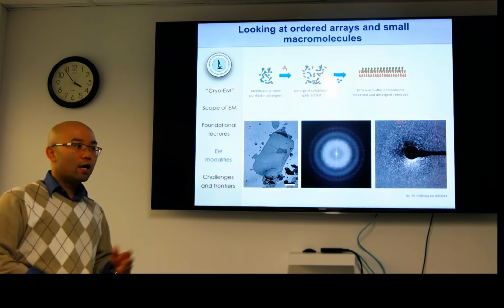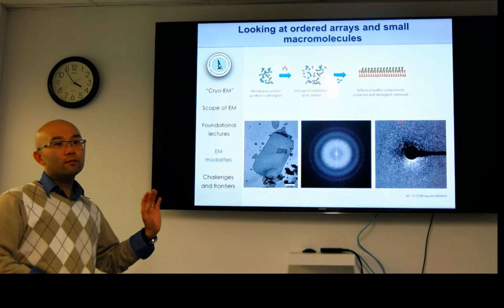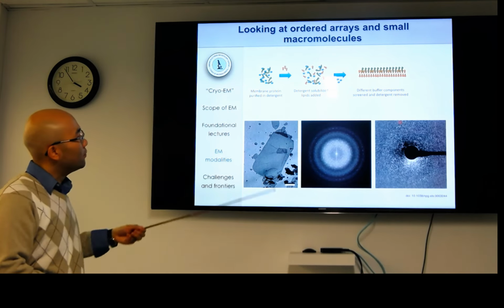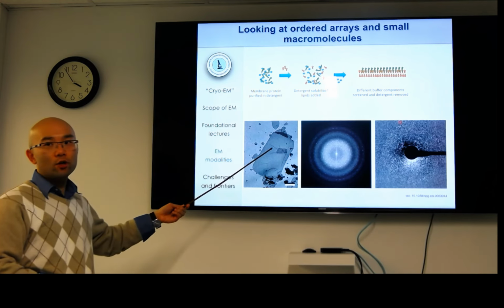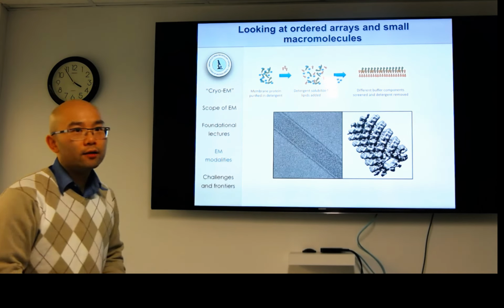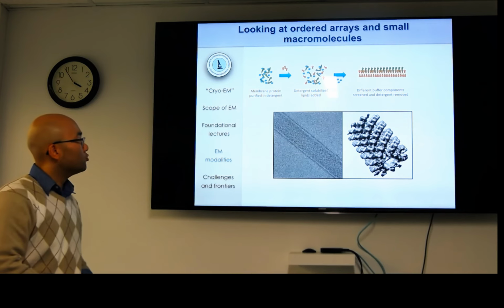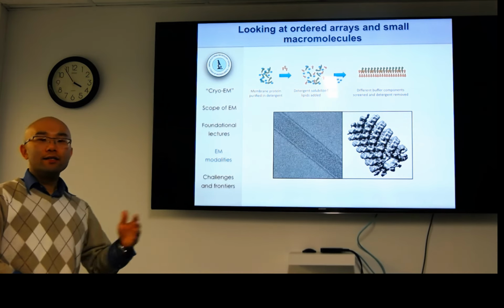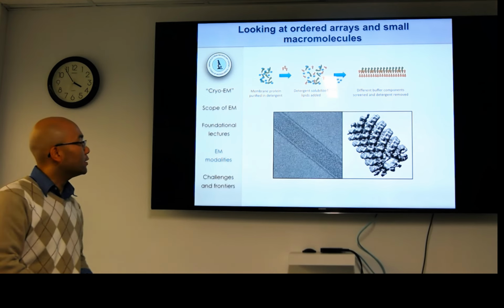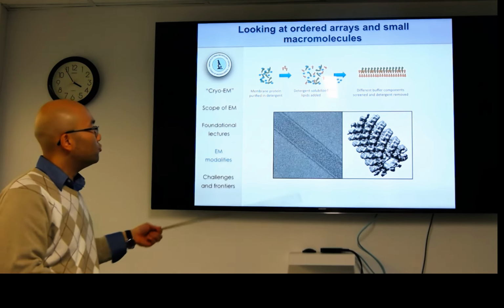So in terms of atomic resolution or near atomic resolution, EM has done that decades ago. The problem was that only if your sample was amenable to it. And particularly membrane proteins naturally like to go into membranes and form ordered 2D arrays. But some people are interested in filaments, and that's just a 2D crystal wrapped around itself. And why that's interesting, like if you're interested in actin, myosin, those interactions, there are many naturally occurring filaments within the cell that people have been getting near atomic resolution for years. So this is one of these tried and true techniques.